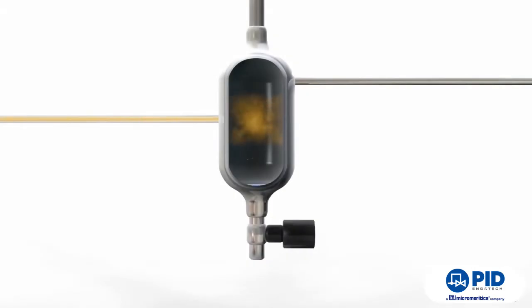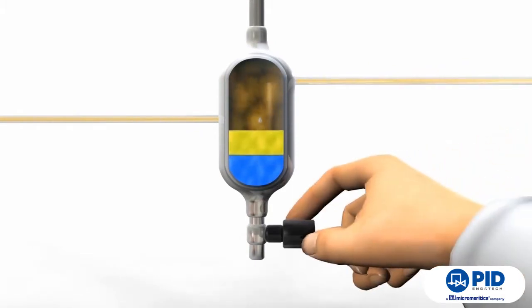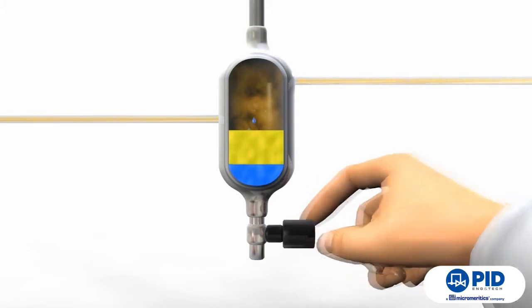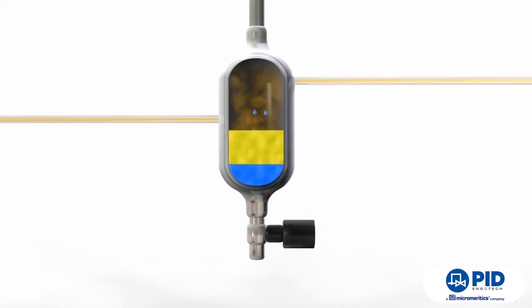So imagine now that you want to get a sample of the liquid product obtained in the reaction. Since the draining at high pressure requires a hydrostatic seal, the liquid must be removed from the bottom of the separator. But taking into account that we have two phases, hydrocarbon and water, only the latter will be drained, whereas hydrocarbons, lighter than water, will remain on top, increasing its residence time in the separator.